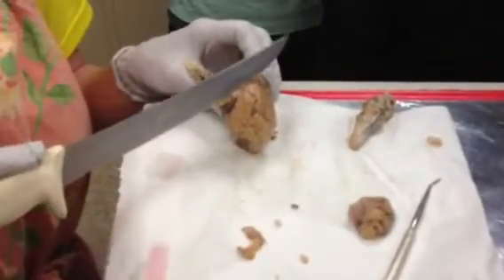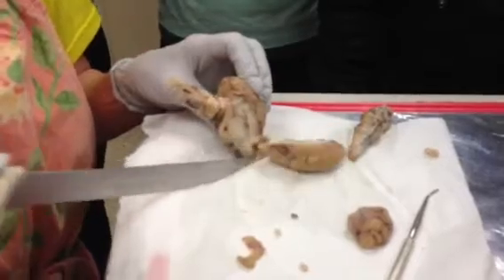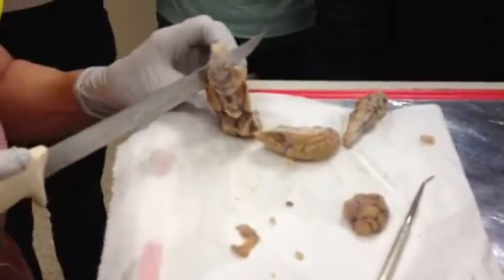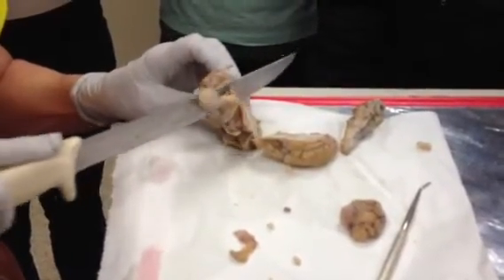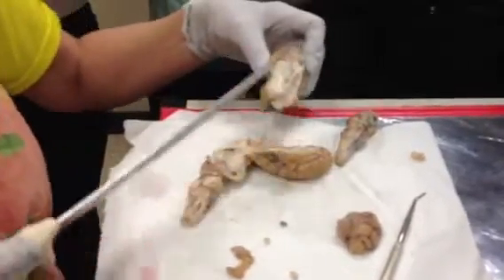Now the next thing I'm going to do is I'm going to take off the hemispheres. Like carving a turkey. They do that quite well.